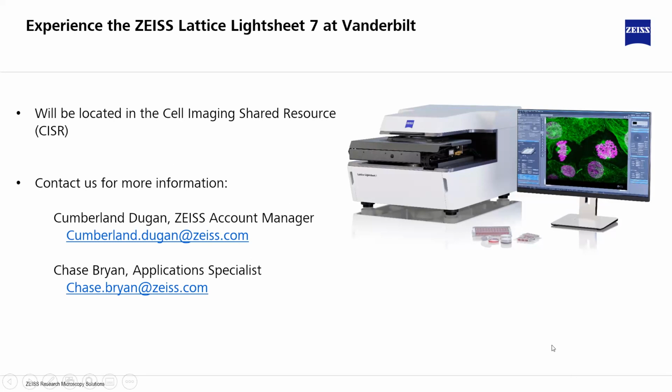How fast does it scan? So obviously that'll depend on the volume you need to acquire, but we do have data showing that I don't actually have the millimeter spec, but we can capture volumes in under a second, depending on your size of field of view. So we can do repetitive volumetric imaging, 1 hertz plus, depending on the size of your sample.